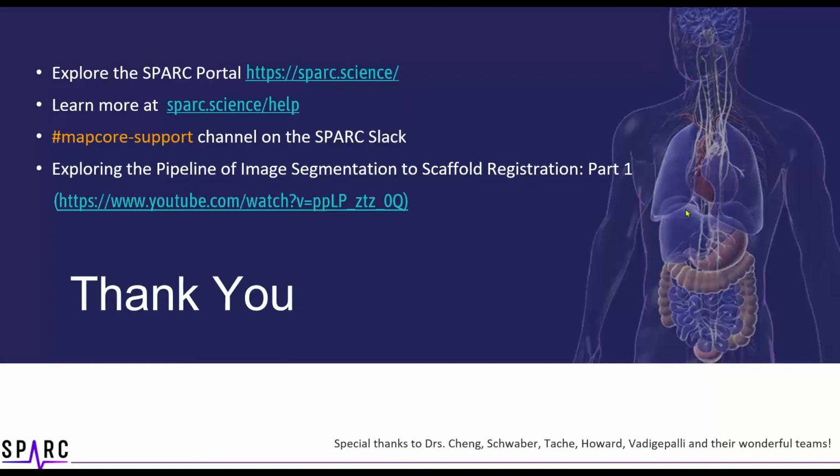So it's a back and forth process to come up with these anatomical locations. And it can be a difficult process for some regions that may not be well defined.